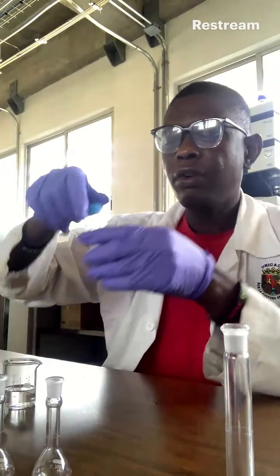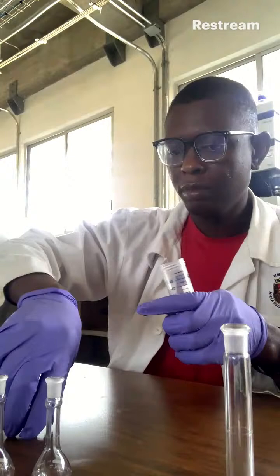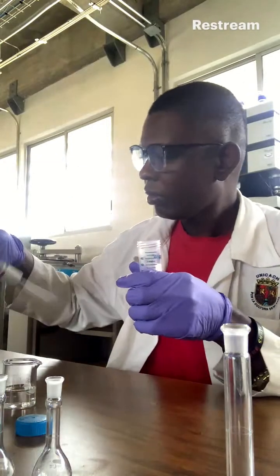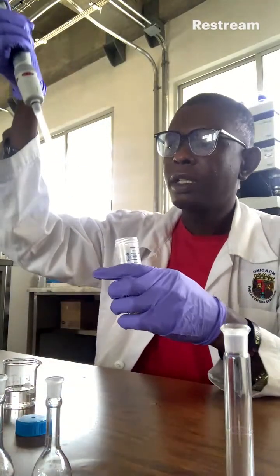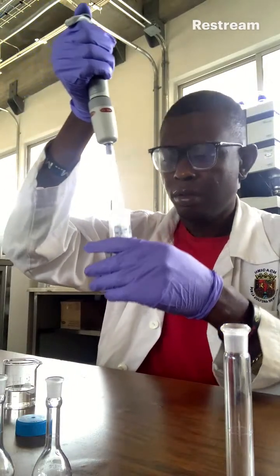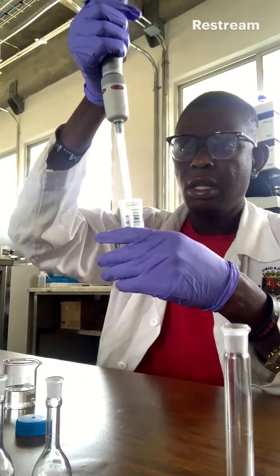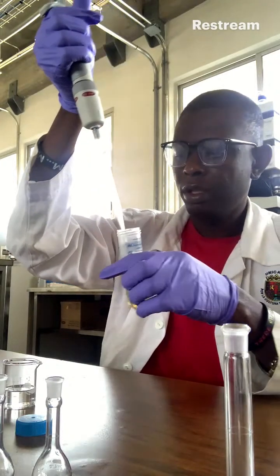Now I want to go for GC agave. The same process I would do, and I will release. And this is 5 ml.